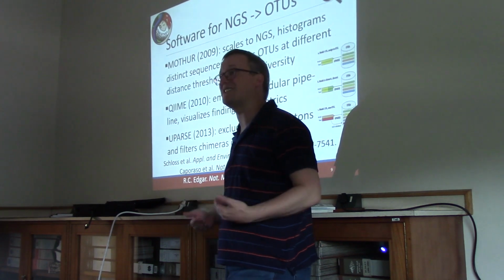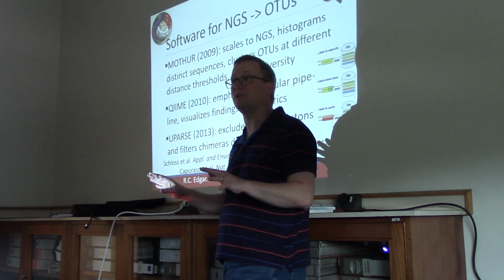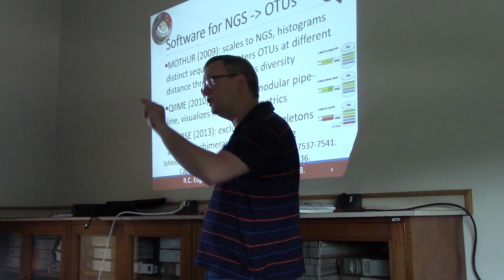That, in effect, is how these decisions typically get used. But because new software is generated all the time for OTU estimation, it's worth your time to think about which one is most applicable to the research question you are asking.